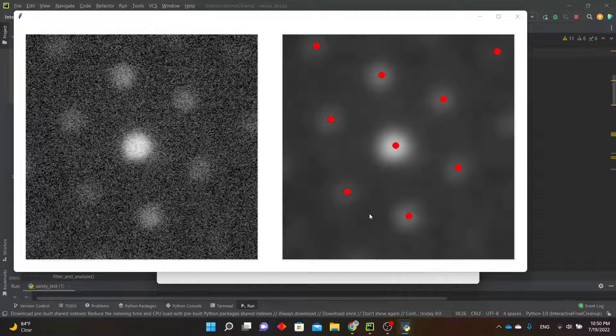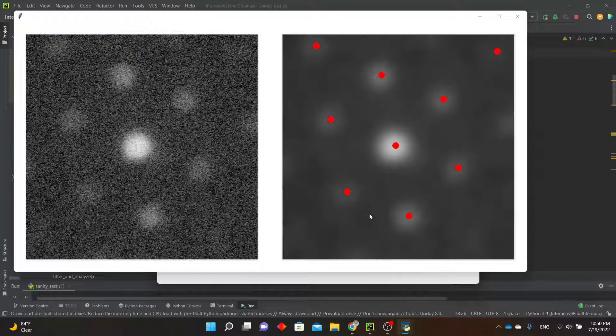The code for filtering and diffraction spot recognition are identical to those in the main PED strain mapping program, so you can use the Sanity Check to make sure that your file is processed correctly when you pass it through the main program.